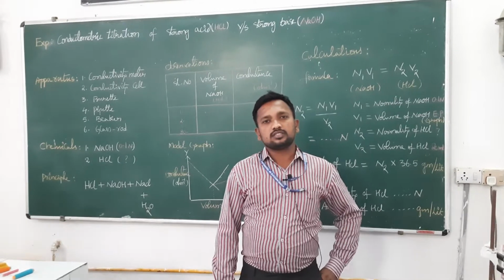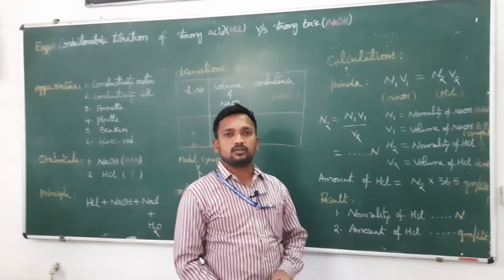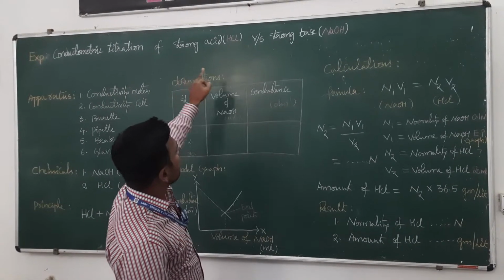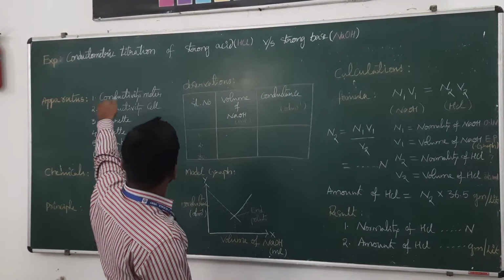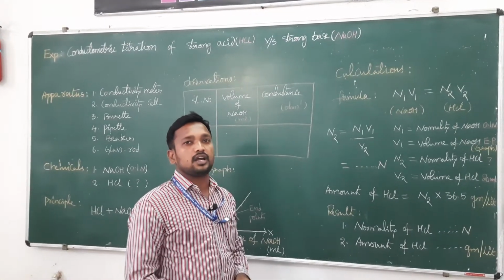Today I am going to discuss estimation of HCl by conductometry. This experiment is also known as conductometric titration of strong acid versus strong base. So, our experiment aim is estimation of HCl by conductometry.